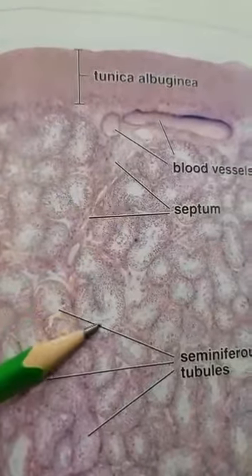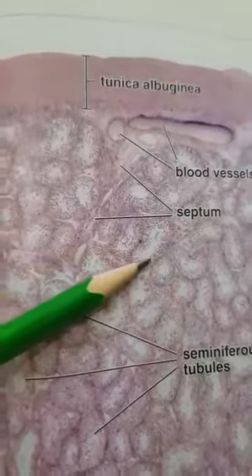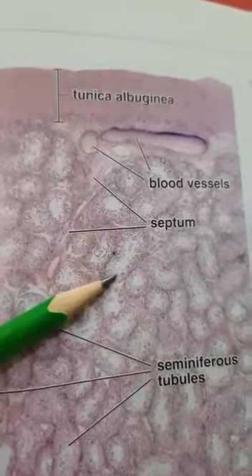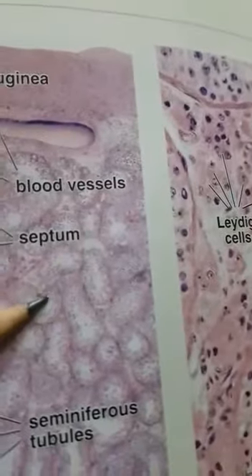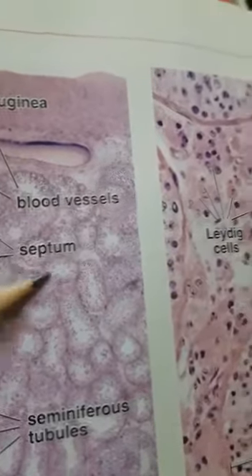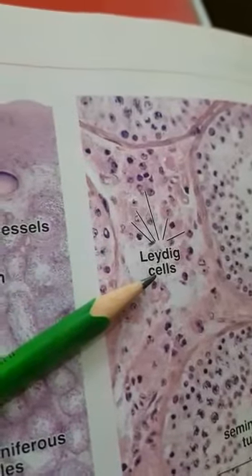The main thing that it carries, you can see again in a cut section of this seminiferous tubule. So many lumens you can see, either obliquely set or very rounded or oval shaped. So many cut sections of the tubules you can observe. Now take another, larger view of the area between these tubules, the interstitium. Here you observe a special type of cell called Leydig cells.